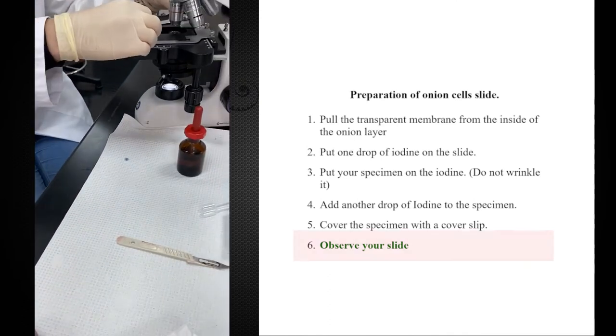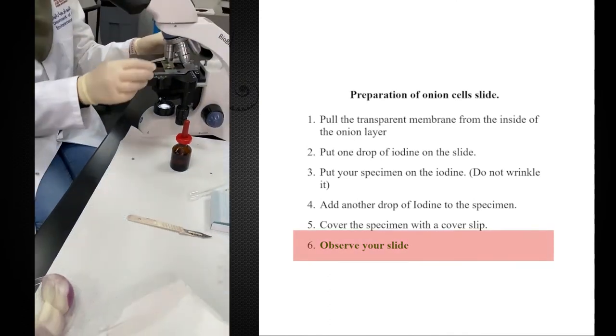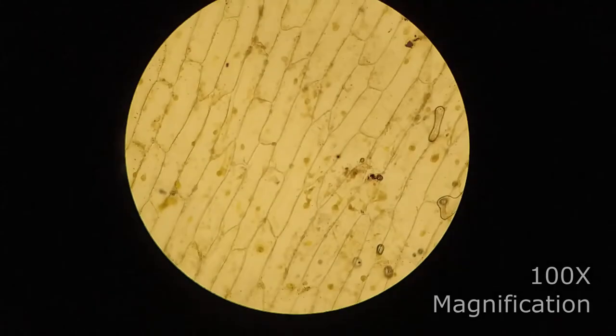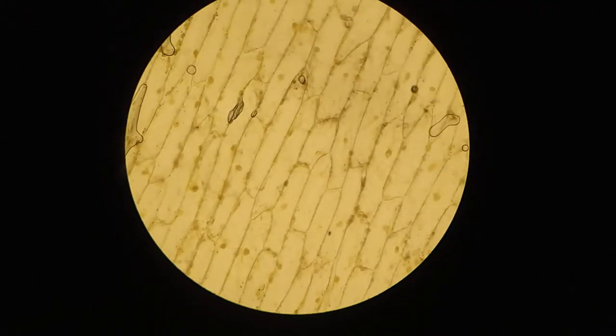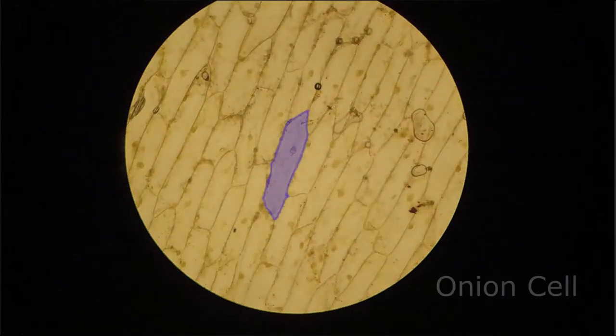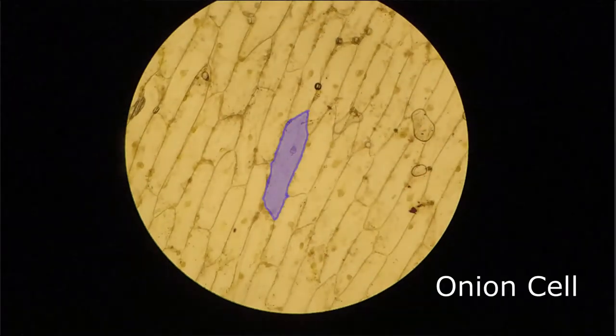This is ready to be focused under the microscope. It should show me the nucleus of the cells and the typical shape of a plant cell. They look nice. I will take a picture of them and post it on Blackboard.